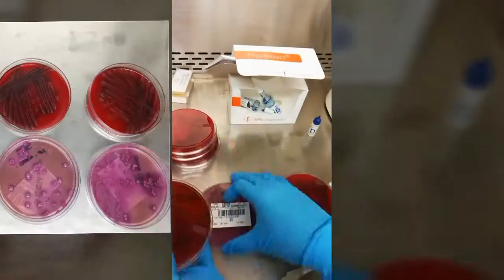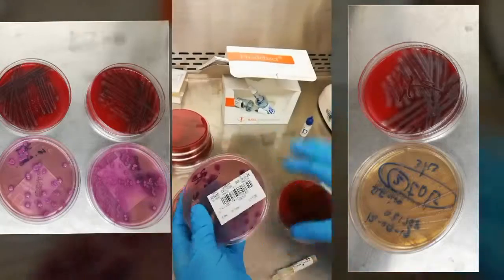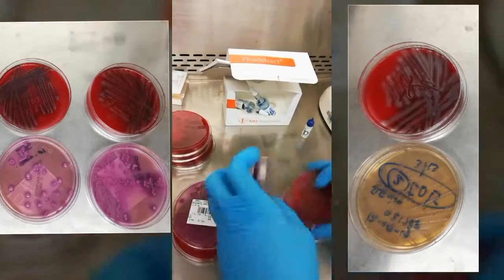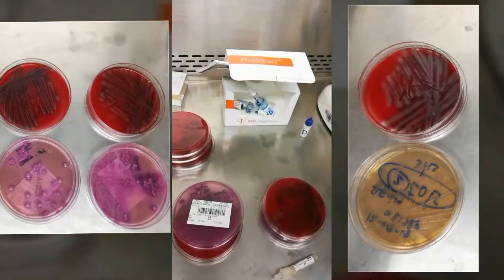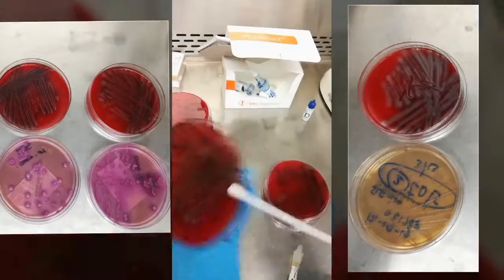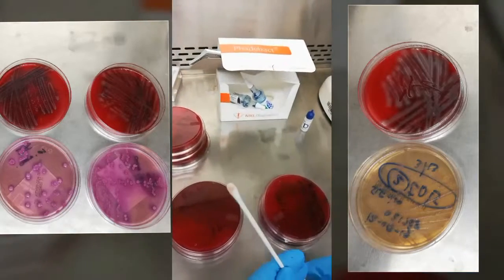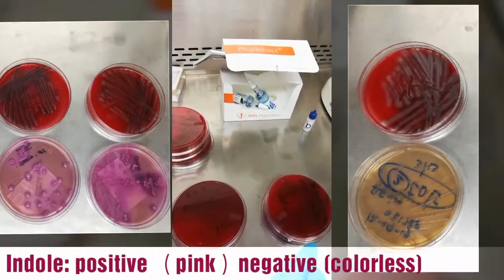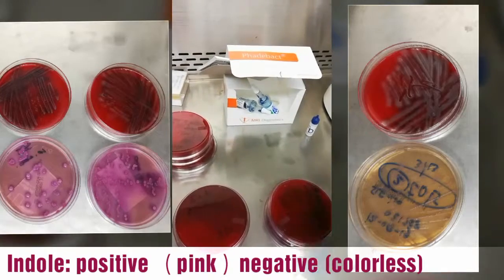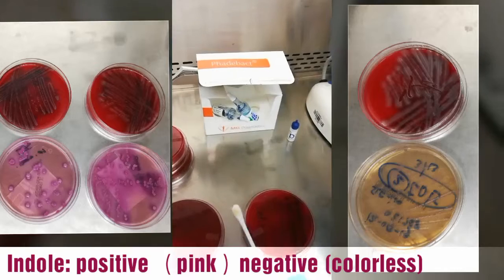Gram-negative rod identification method. In the microbiology lab, we use the MacConkey plate and blood plate together to separate the gram-negative organism from gram-positive organism. In MacConkey plate, if the colony is lactose fermenting, it will be pink in color, so we only perform the indole test.